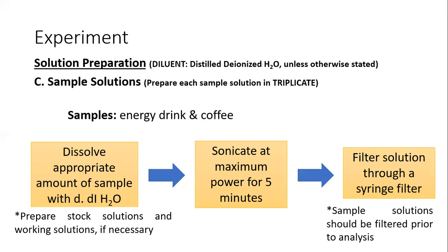Okay, so important dito sa HPLC na lahat ng solutions na i-inject nyo, pati yung mga mobile phase, lahat sila na-filter. So bakit kailangan na-filter sila? So that is to prevent the blockage of your column. Okay, so para hindi magkabara sa column nyo. Okay? Kasi pag nagkaroon yun ng bara, mas madaling masisira yung column nyo.